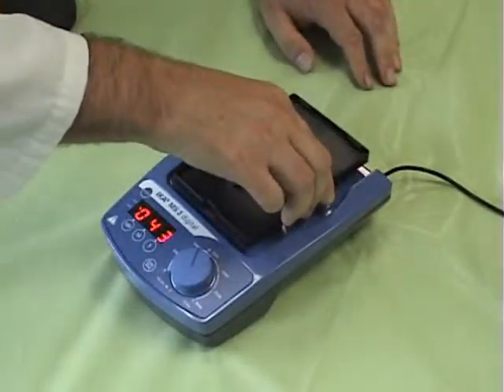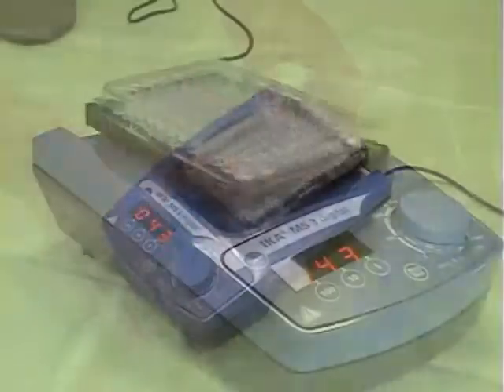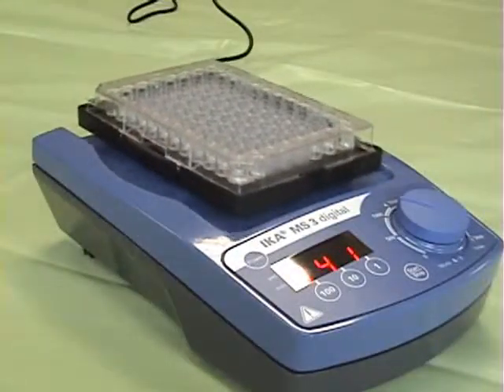Standard size microplates can also be agitated using the special microplate attachment that is included.